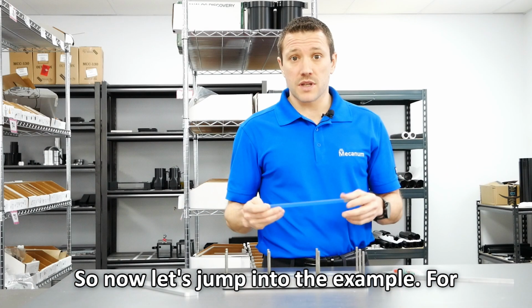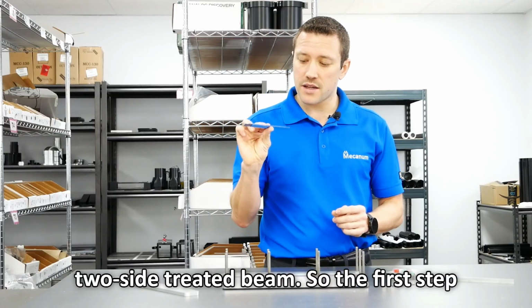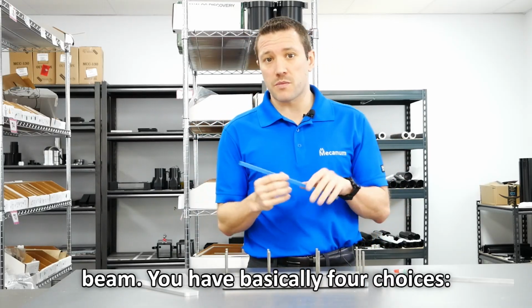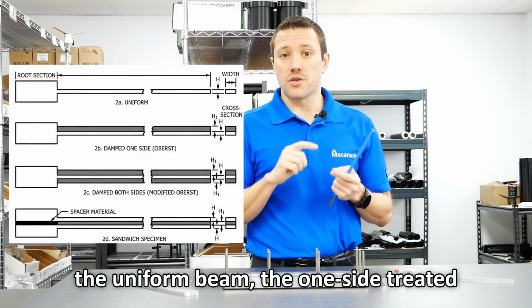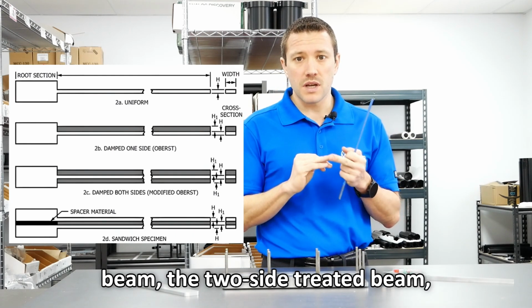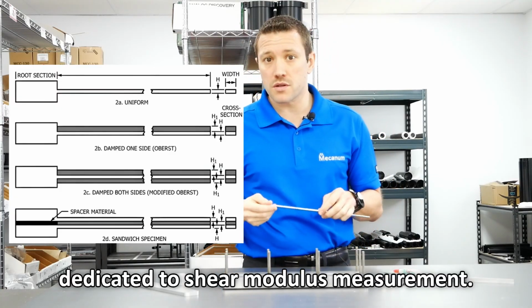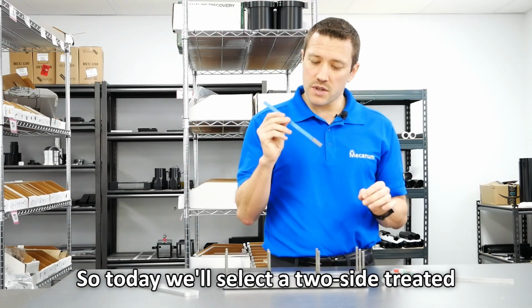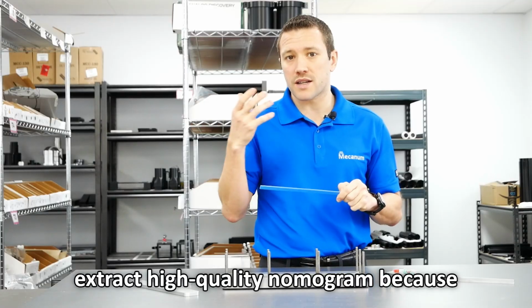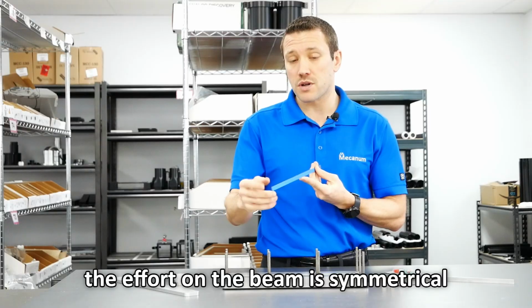So now let's jump into the example. For the example today, I will test a two-side treated beam. The first step of this method is to select your type of beam. You have basically 4 choices: the uniform beam, the one-side treated beam, the two-side treated beam, and the sandwich beam that is dedicated to shear modulus measurement. So today we'll select a two-side treated beam. It's an interesting choice to extract a high-quality nomogram because the effort on the beam is symmetrical when you excite it.